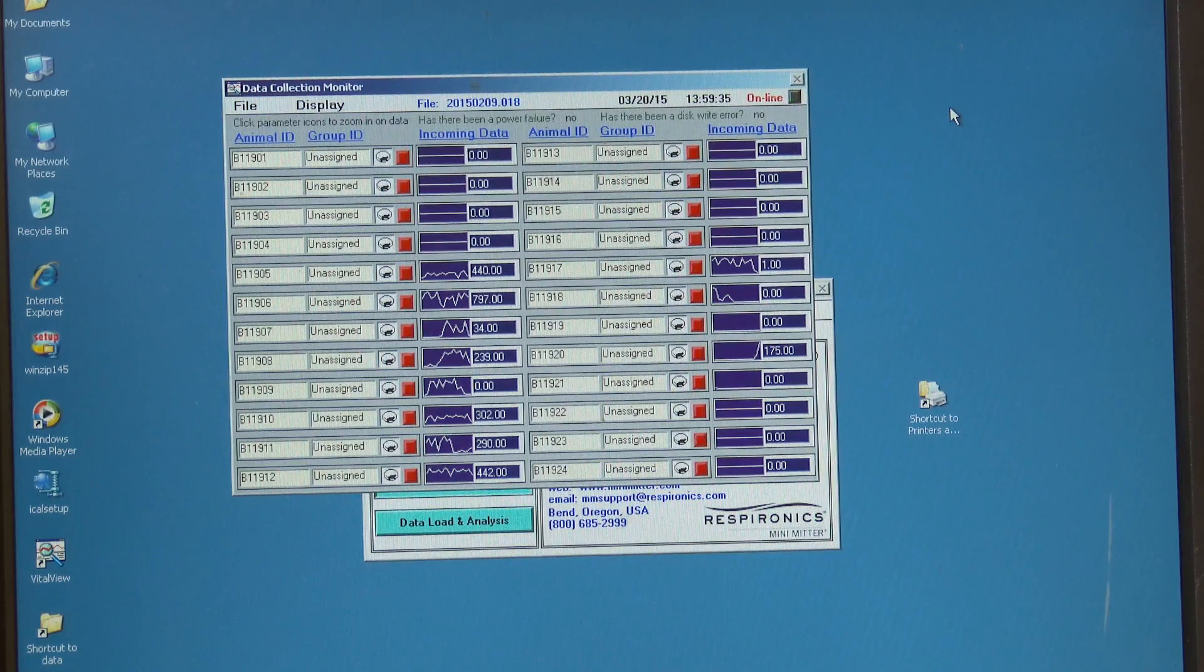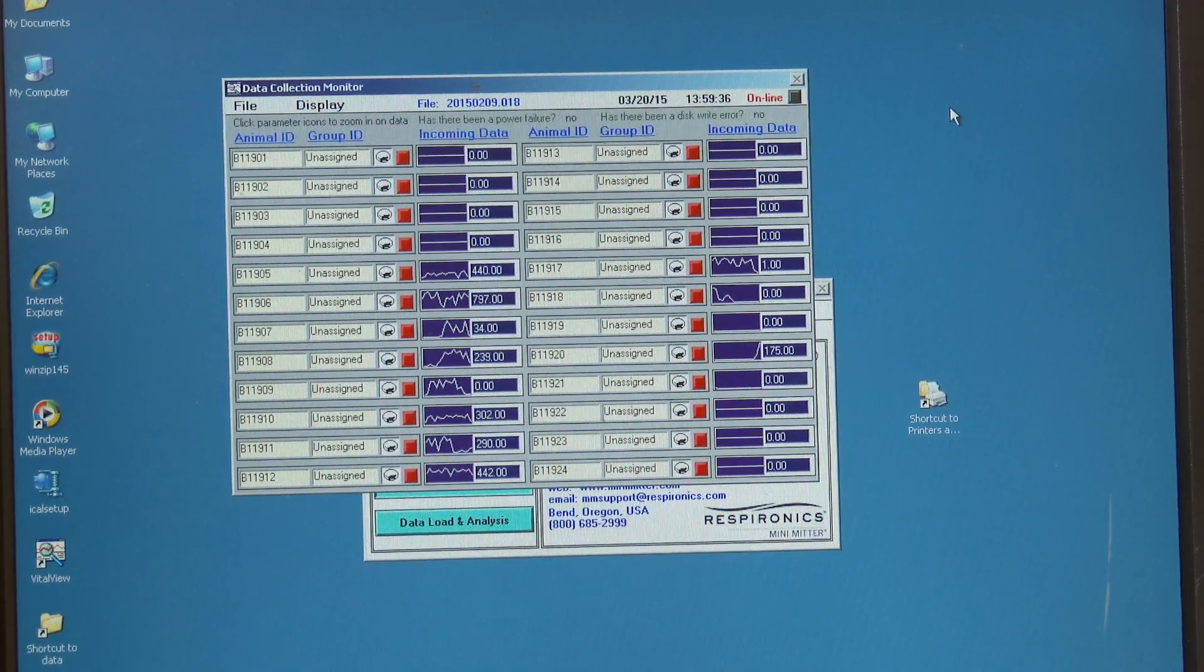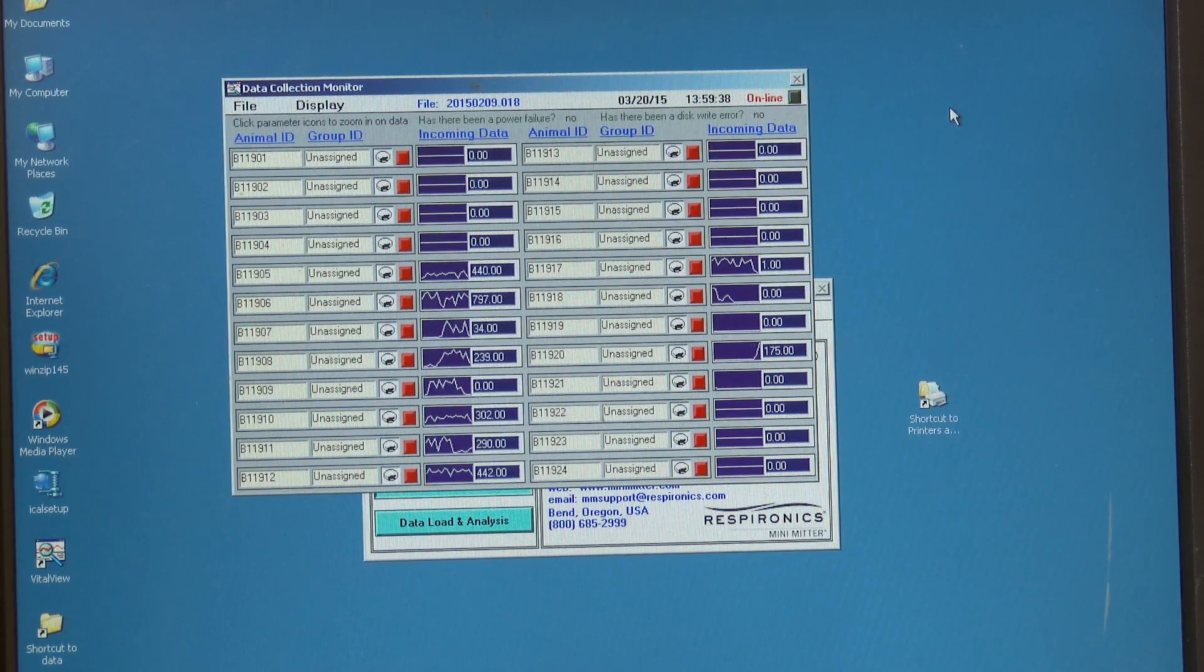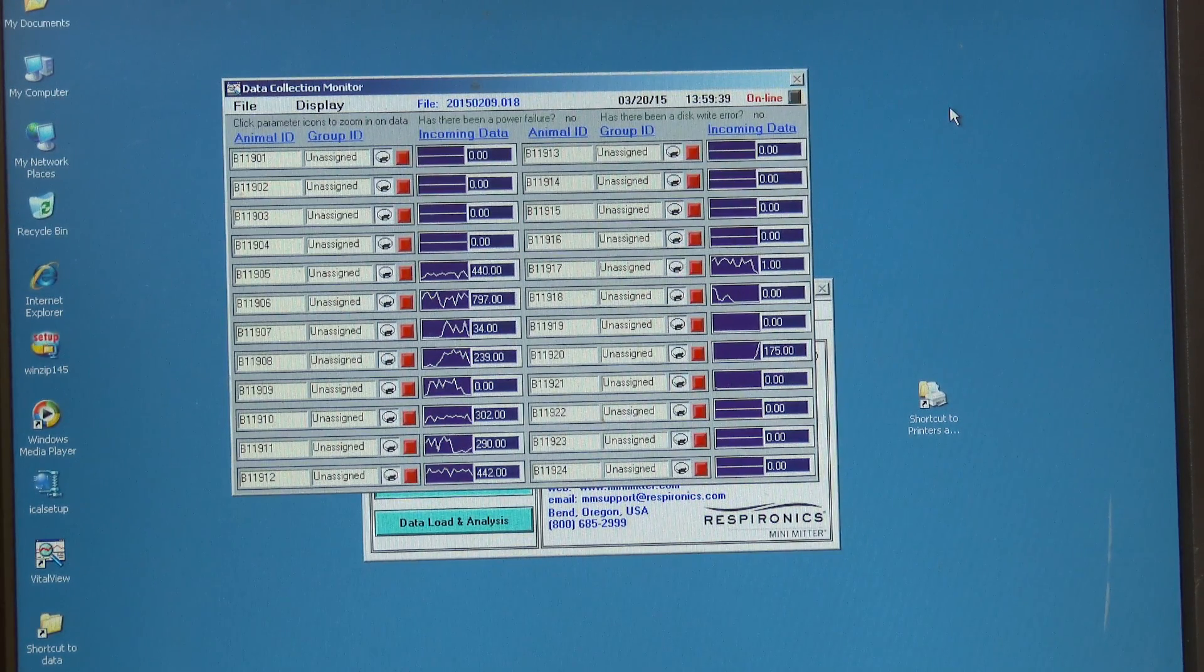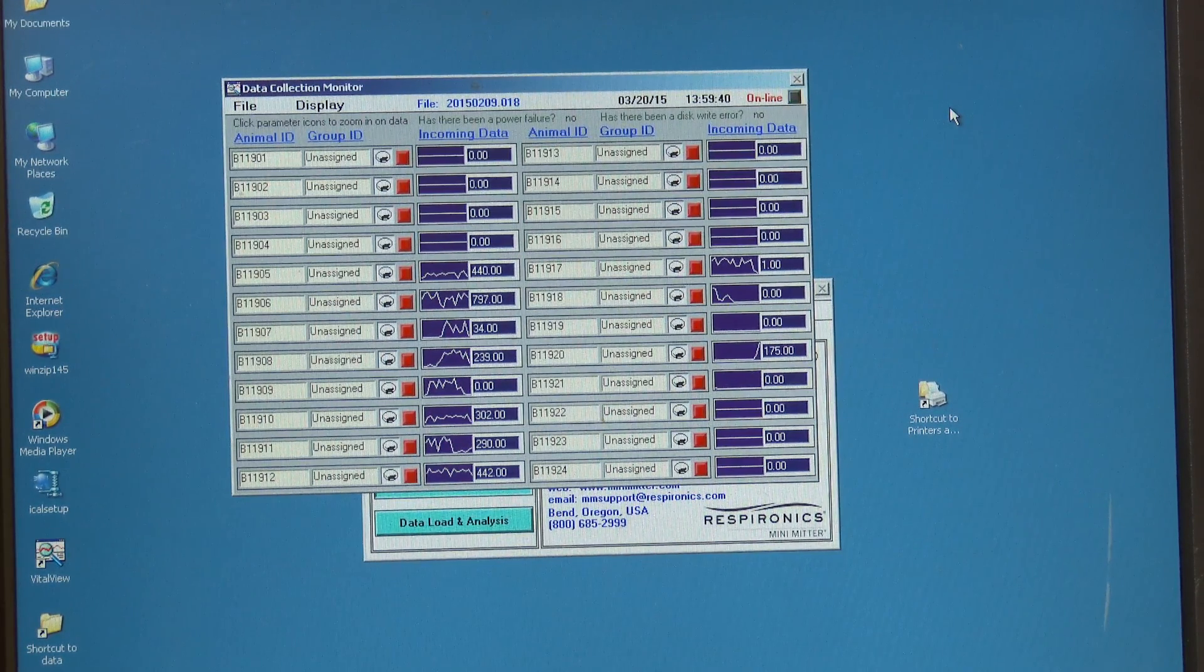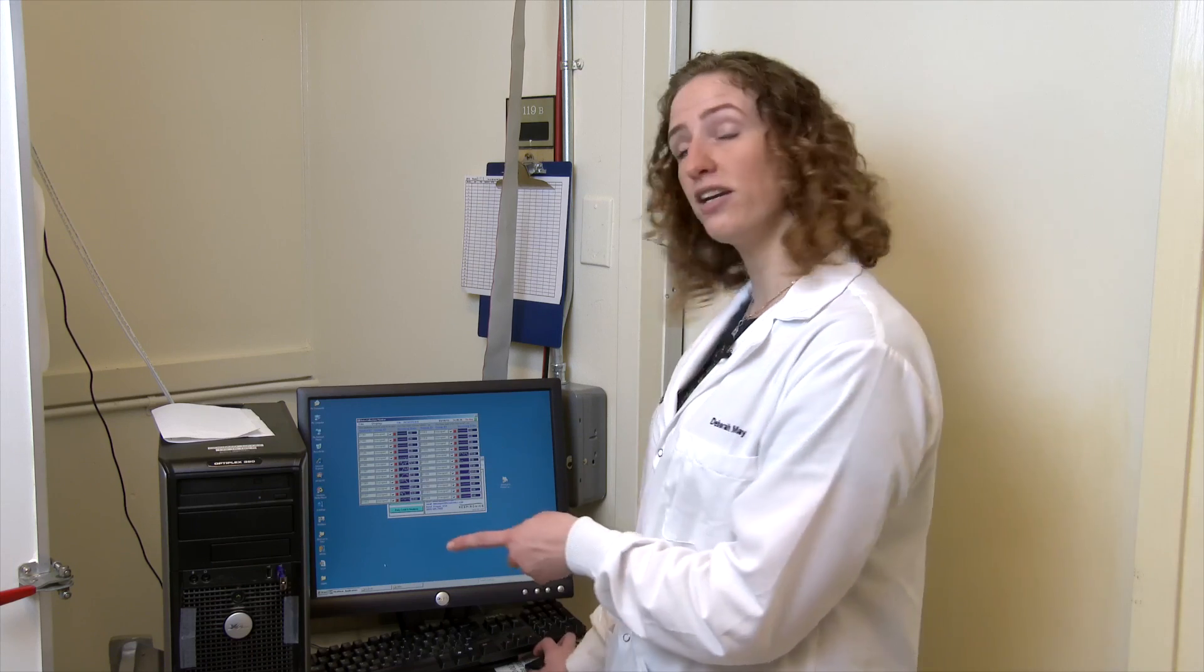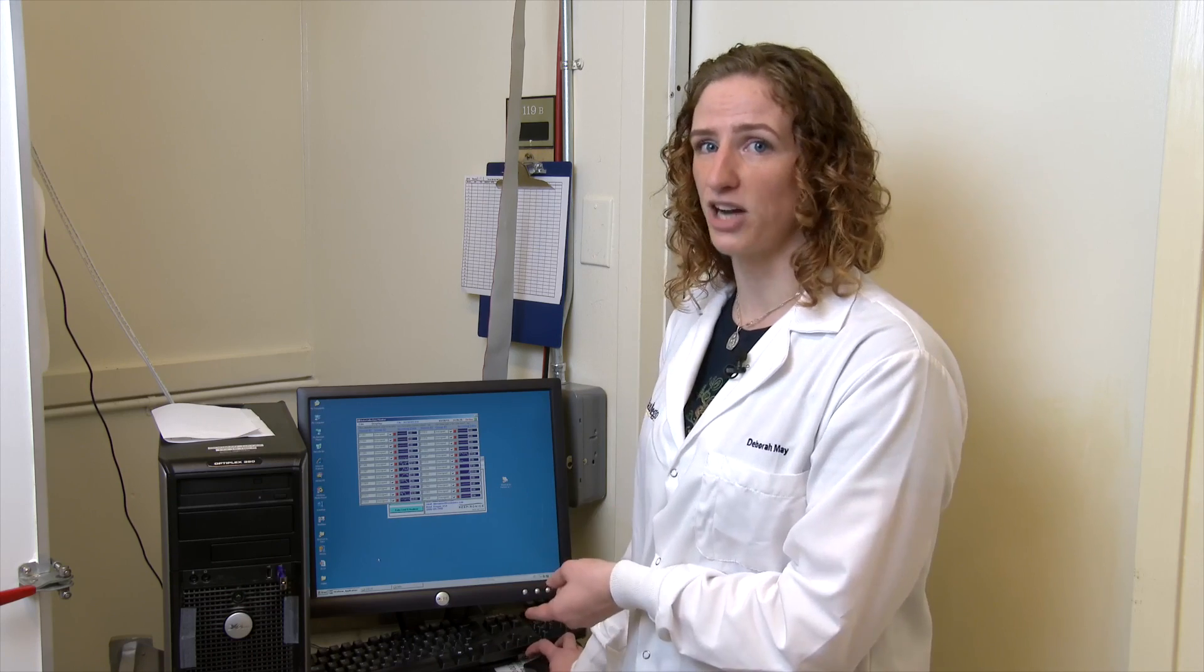From this window we can spy on the current activity of this group of animals and what they've been doing for the past couple of hours. When we pull data every day, we put in a USB drive, copy the current data over to that drive, and take it to our lab to be analyzed.